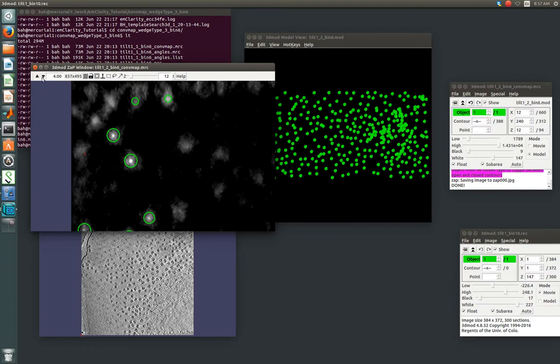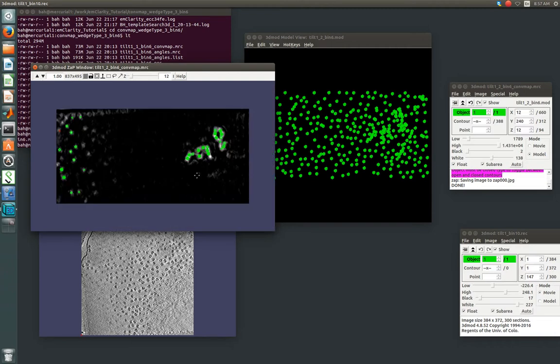So, that's one way to edit it, is just by selecting the contours here. And you see our junk also lit up pretty clearly, so we could go ahead and delete some points over here.